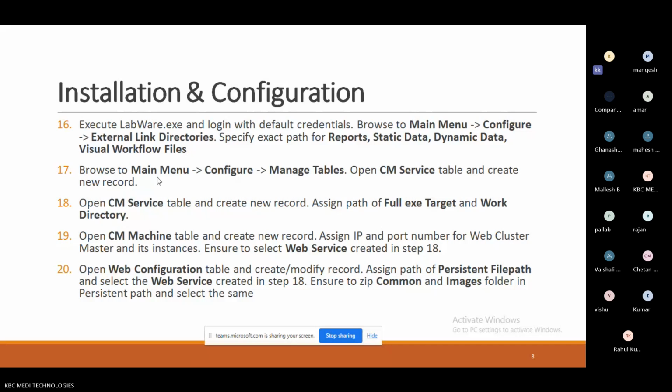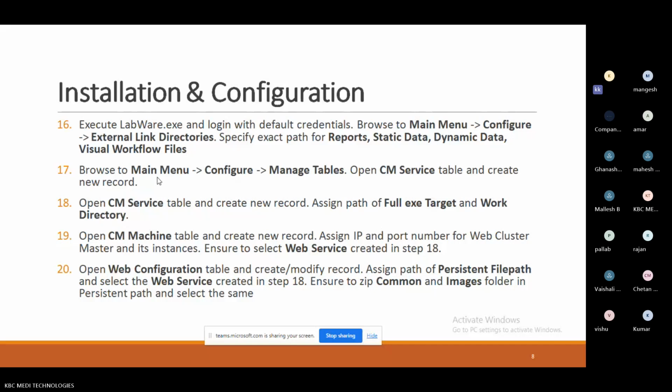So what is the difference between installation and configuration? As of now, I have done installation. Configuration indicates maybe in the training 4 to 6 persons are there. Maybe 6 persons are from different companies. The way person one follows a procedure, the second person may not be able to follow. Company to company procedure may be different and they have their own practices. The way the customer is following, the same configuration needs to be designed in the LIMS system.